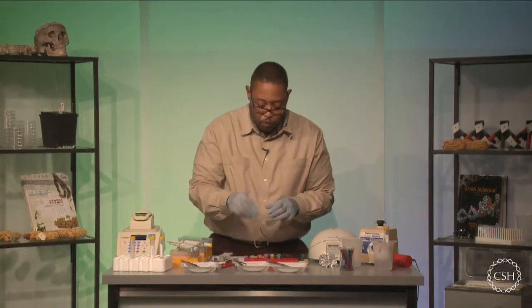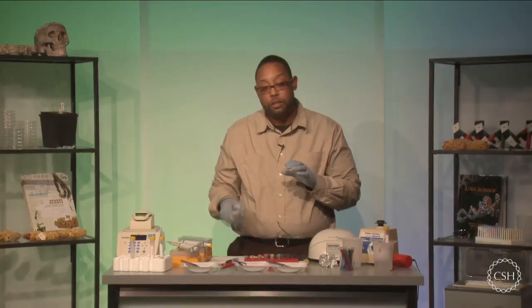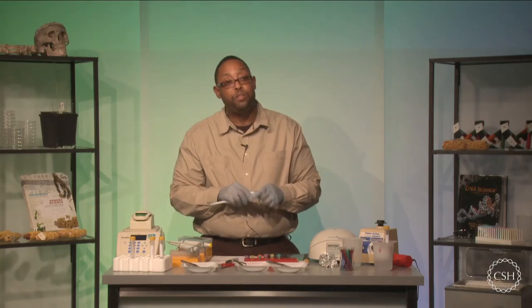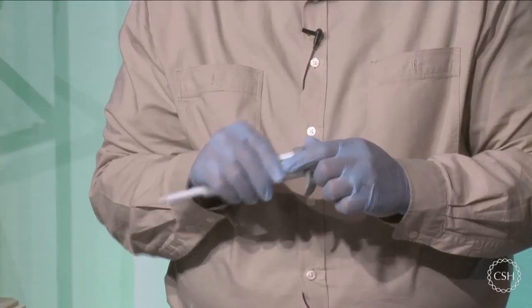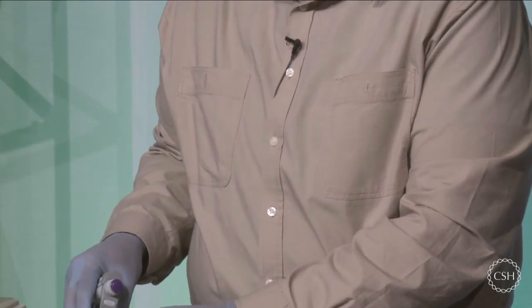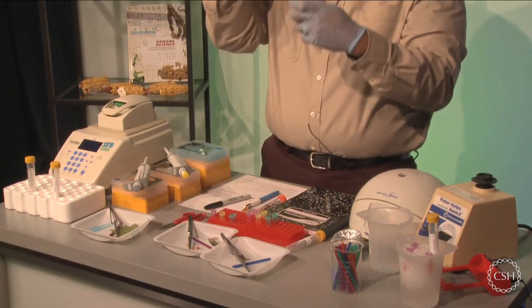Okay. So I have samples 1, 2, and 3 ready to get started. And now I can start adding my individual reagents. The first thing that I'm going to start working with is my lysis solution. And I'm going to add 300 microliters of my lysis solution into each test tube. So I'm going to start by working with my P1000. And I'm going to take out 300 microliters and add this to each individual tube.